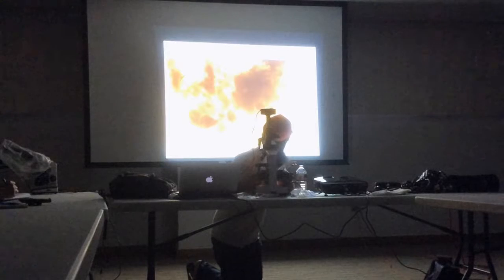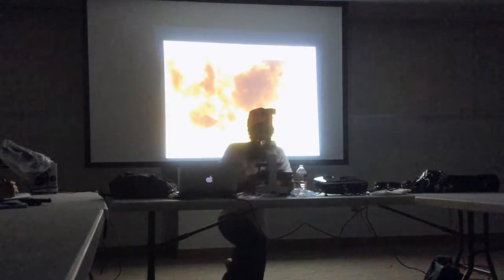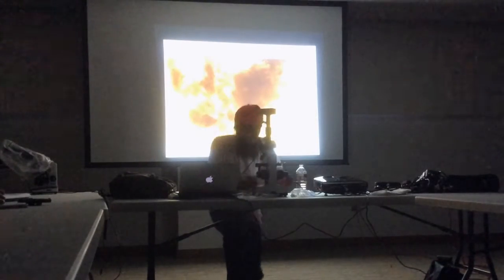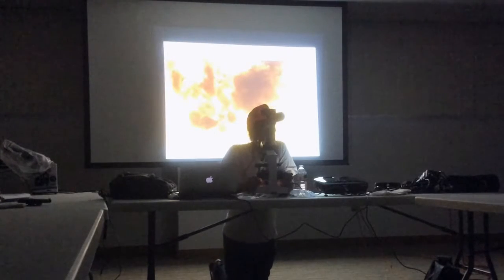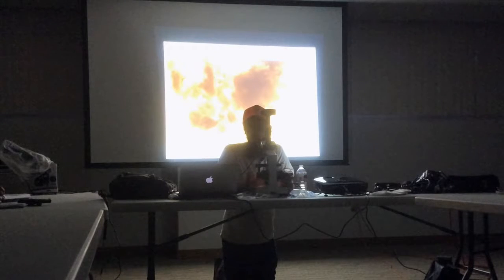Okay, can you see that thing up at the top? What is that? A leg? Another fungus, this thing that's twisted right here? Oh, it's twisting. You can see how I zoom through it and you can see how it twists. So you see that it's not a fungus because it's twisting like that. What that is most likely is some sort of plant material, some sort of fiber, or some other deal in there.